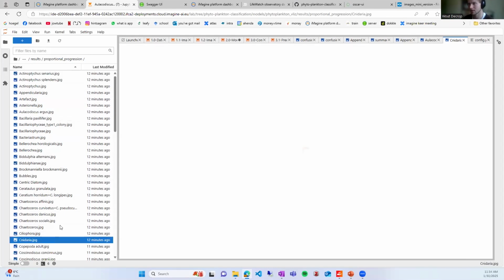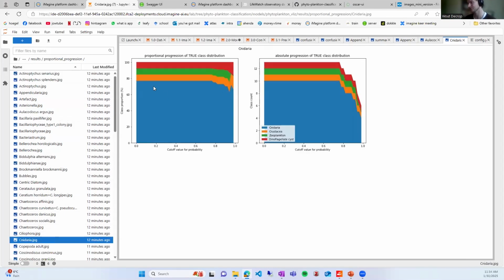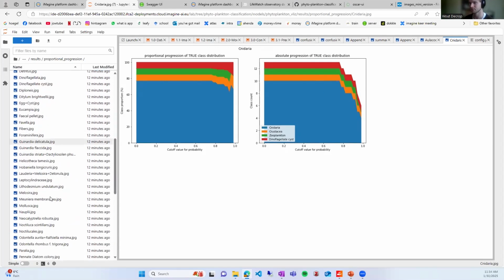So if you look at this class here, it doesn't really make sense to apply a filter, because if you increase the cutoff ratio, you remove data, of course, but most of the data removed is also from the right class. So it doesn't make sense to say, let's go from an 80% confidence and tell the user we don't have to validate anymore, because almost at every cutoff ratio, it remains the same performance. It remains 75% correct, and it even decreases with the higher cutoff ratio.